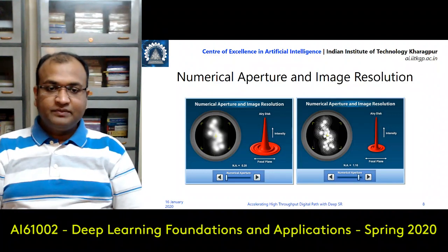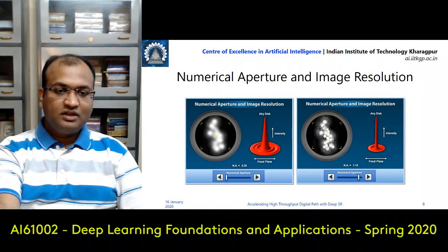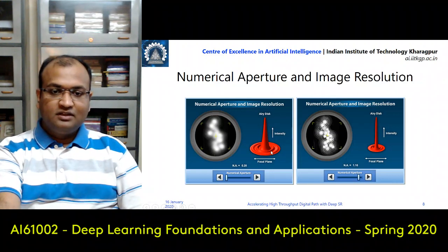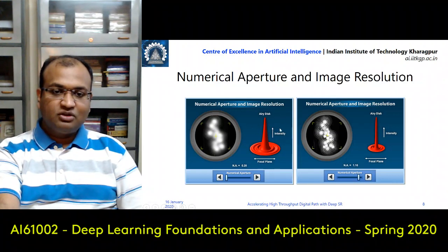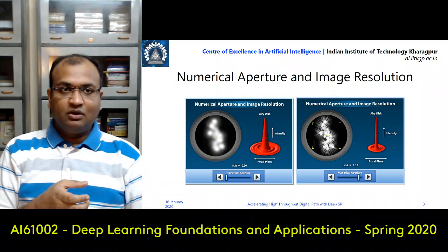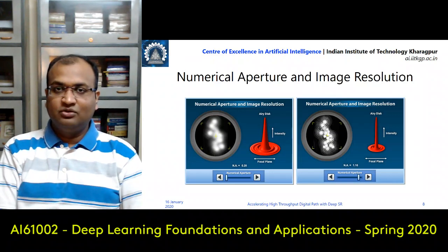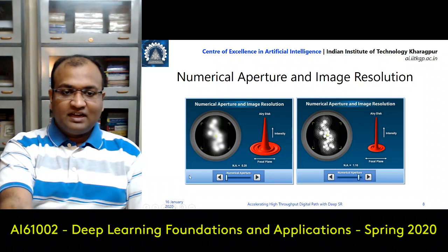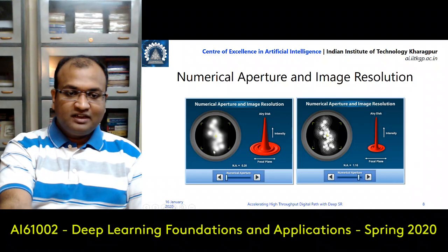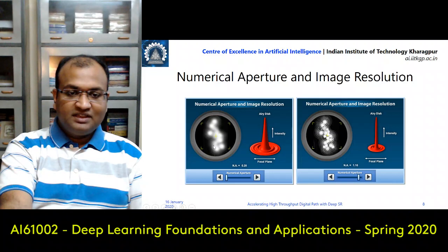Now here, when your lens is very far off, you would see that your numerical aperture is low, and as a result, the resolvability between these two samples becomes lower and lower. Okay. So what you see over here is what is called an Airy disk pattern. That is the net result of the effect created by a lens when a lot of points are being seen through it. Now, you are able to discriminate between this and this. So these are resolvable. Between this and this, that is resolvable. At this particular magnification, you can do that. But between this and this, it is not resolvable.